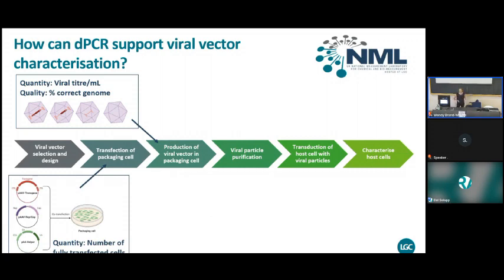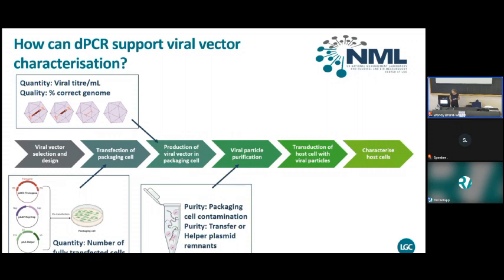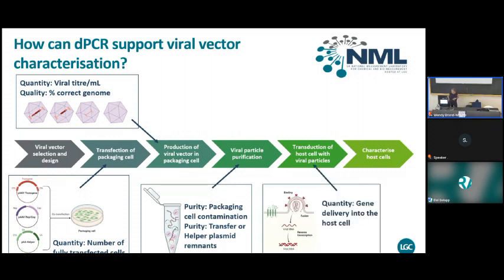But we can start to look at the actual transfection efficiency into those helper cells. If we don't get all 3 of those plasmids in, we won't make as many AAV particles. So it's part of that biomanufacturing. How can we improve that process? Big area that we are just starting to look in is the kind of carryover, the cell contamination. So the AAV particles are put out into the supernatant where you collect them and you clean them up and you purify them. But maybe there's some leftover host DNA or any kind of debris left over from those packaging cells, which may cause harm to the host when you put the AAV particles into the patient.